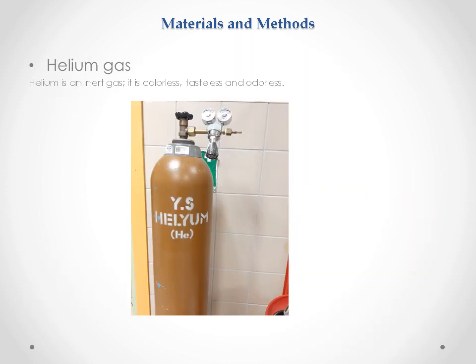The inert gas helium is tasteless, odorless, and colorless. In our study, it is used to strip the oxygen from the water in order to calculate the dissolved oxygen in the water.